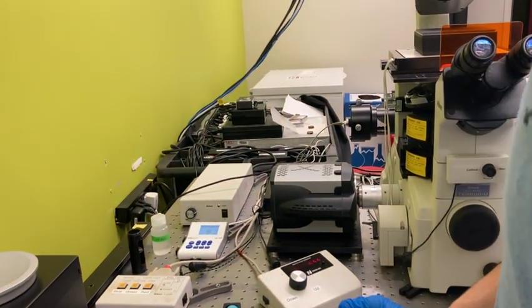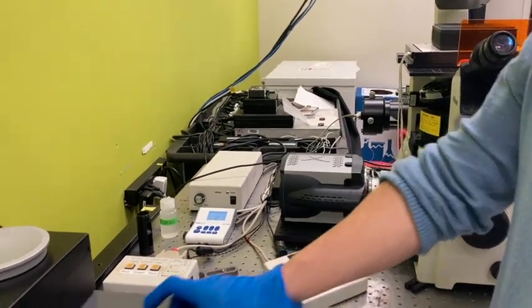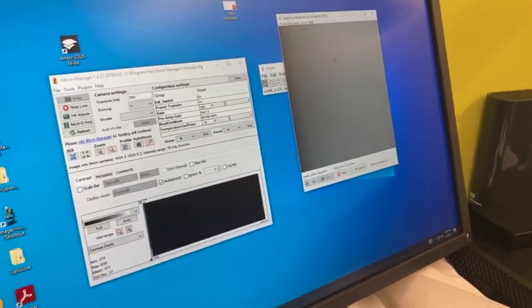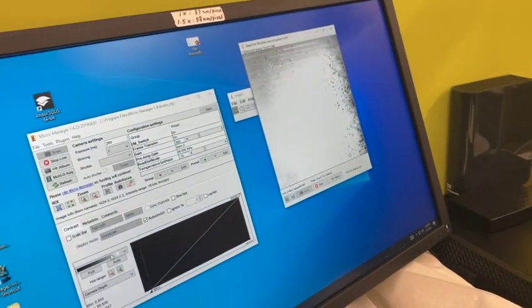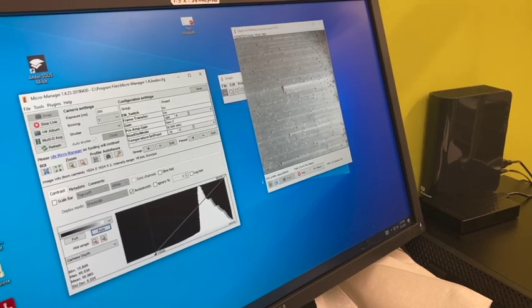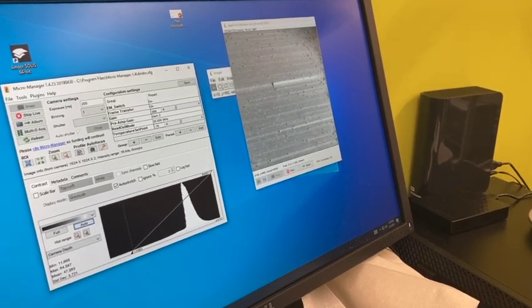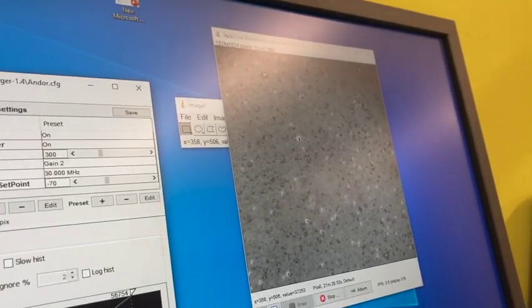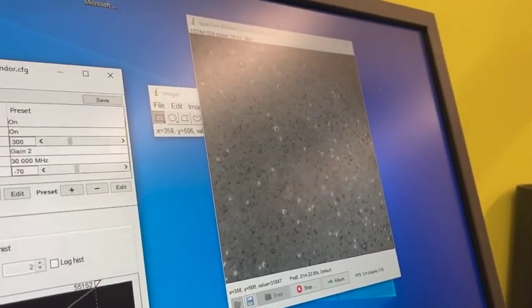You can do experiments with this light turned on. It's really high-tech. It's worth like $10. So it's totally black because we don't have blue light on, and we turn the light on. Whoa, that's a lot because I have a lot of GFP there. But yeah, you can see the intensity is going down. There's a lot of GFP and it's bleaching.